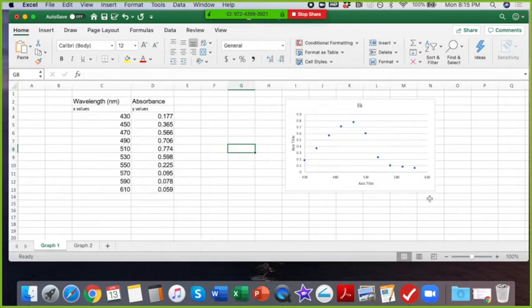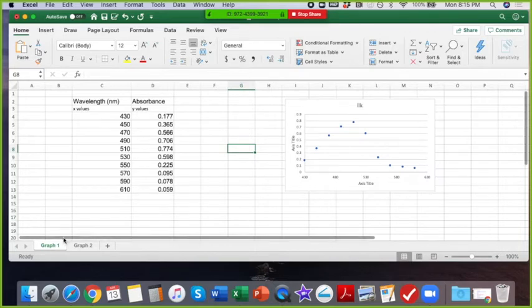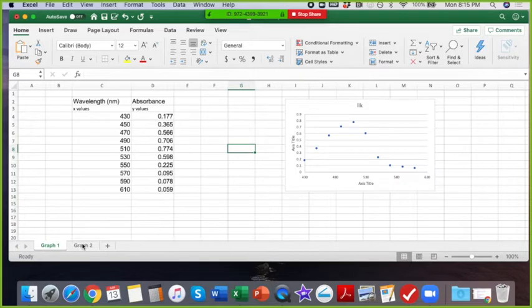All right, and for those of you who are Excel and spreadsheet experts, I apologize for giving you an extra little lecture on how to use Excel.